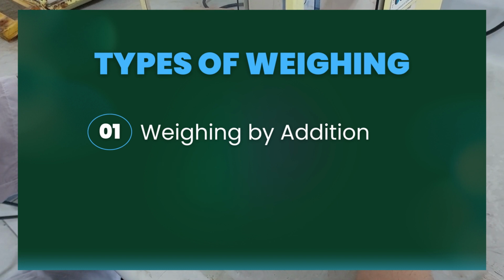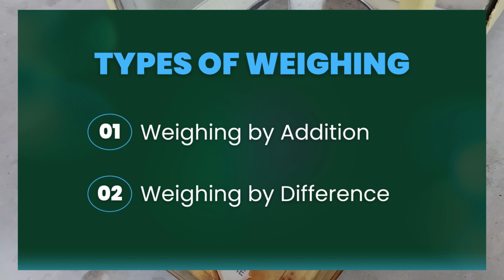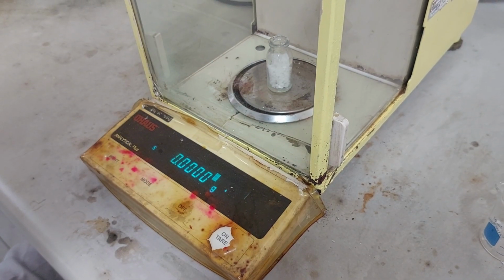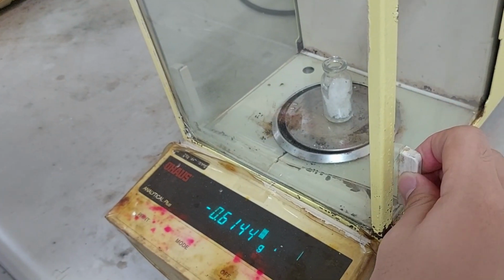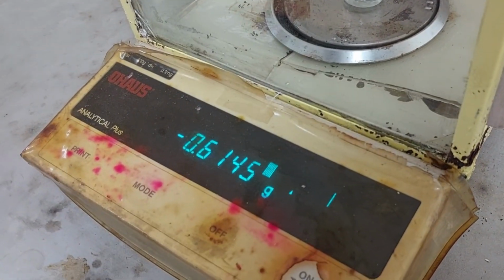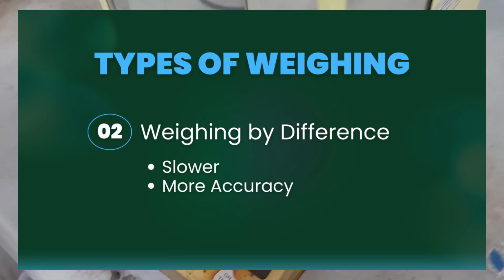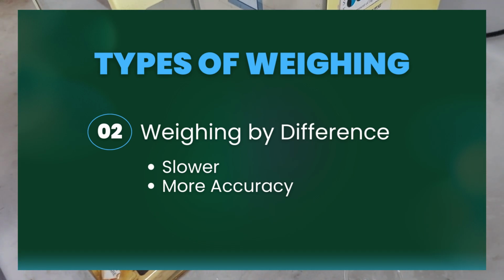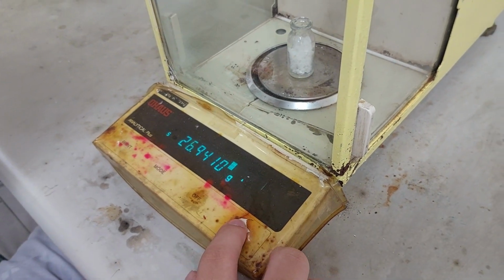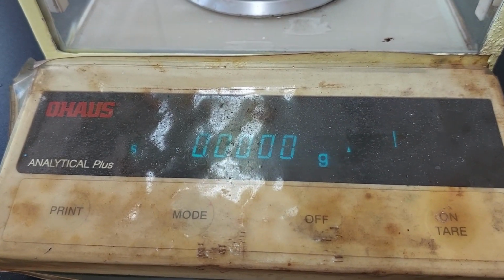the findings. The second technique is weighing by difference, which finds the mass of the reagent by taking the difference in the mass of its original container before and after an amount has been taken from it. Weighing by difference is done when absolute accuracy in measuring is needed for producing solutions of specific concentrations. This is because weighing by difference actually eliminates errors that may come from using tare or from the zeroing of certain containers on the scale.